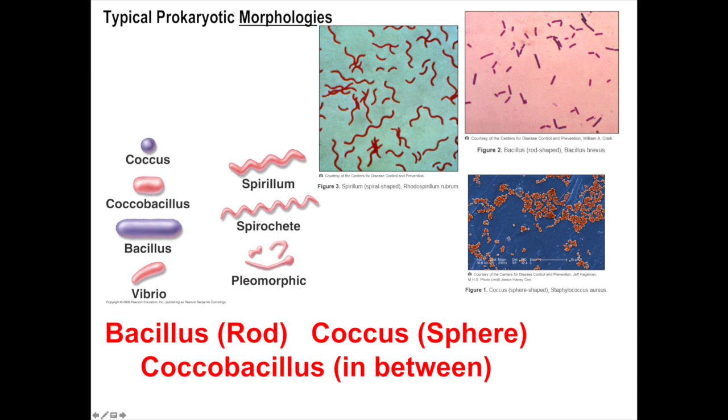So bacteria are classified by how they look under the microscope, their shapes. So a coccus is a sphere. Okay, so that's what it is. It looks like a little ball. And so over here in the blue and orange image, not the kind of microscopy that you will do, but you'll see that these look like a whole bunch of little balls. Okay, bacillus is longer than it is wide, and it's like a rod. And this is a bacillus in the upper right. So this is what it looks like under the microscope for the same kind of technique you'll be doing.